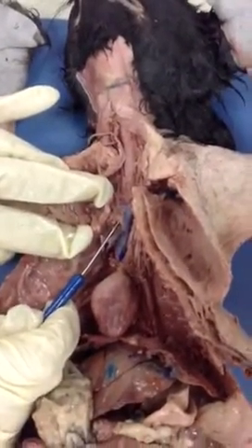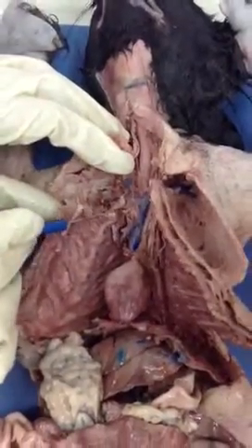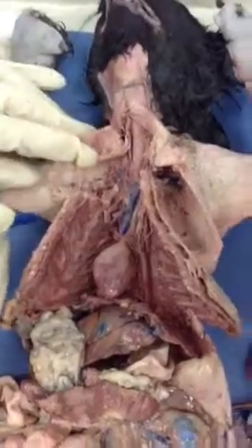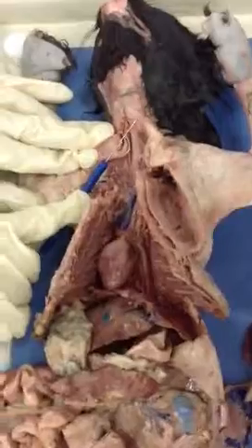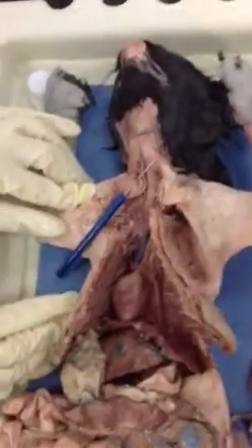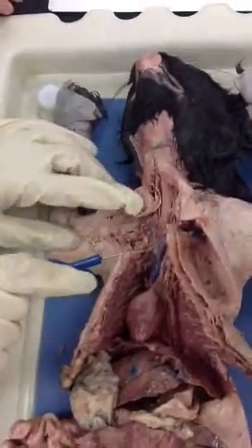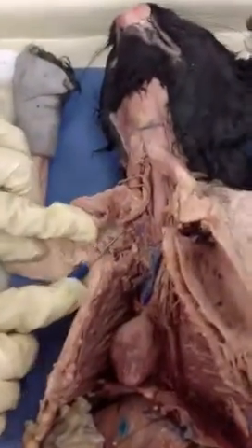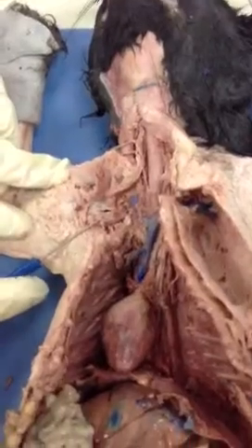The right subclavian? Right subclavian. Very good. You cut out the branches of the subclavian. All right. Now, here we draw an imaginary line, right? That way we localize the axillary region, right? I know immediately that when that subclavian goes into this imaginary line that I have here, now I call it what? Axillary. Very good.